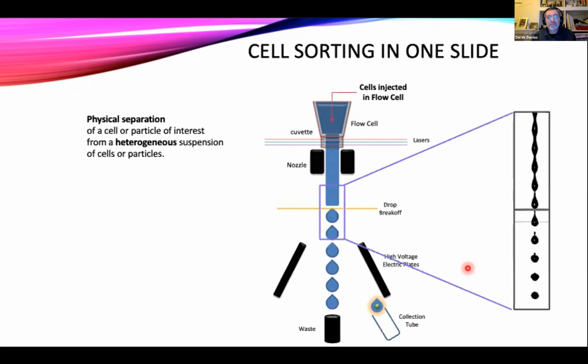This is the picture that we see, and one of the skills, if you like, of being a cell sorter is that you get to recognize that this looks like a good image. We can see our solid column here starting to break up into droplets, but they're still attached. Here's our break-off point, and then here are our detached droplets.